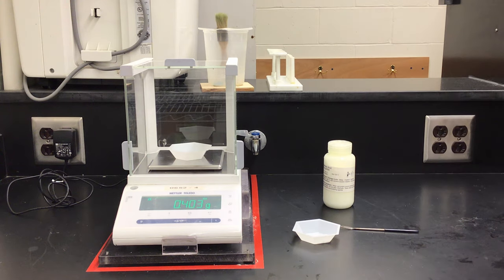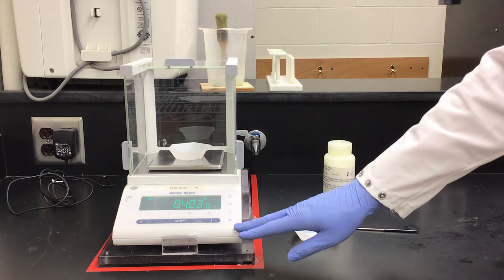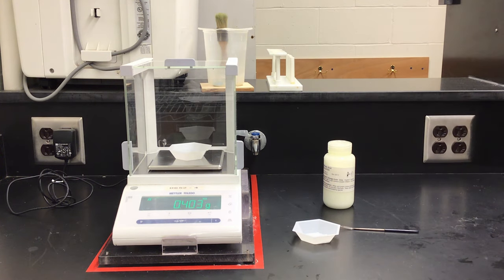Now that it is reading 0.403 grams, I'm going to shut the door to make sure that is an accurate reading. The mass is not changing, so I know this is accurate and I can record that I have massed out 0.403 grams of benzoic acid.